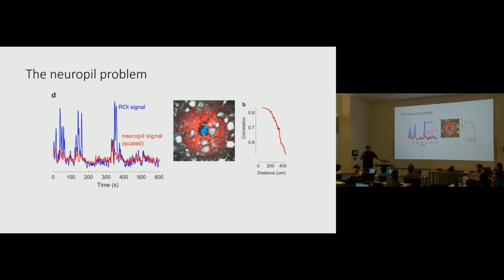And if you start analyzing that signal, which people doing wide field imaging do, you start realizing that it has all sorts of interesting functional properties, like it's responding to stimuli. In visual cortex, it's retinotopically tuned, actually much nicer than the cell bodies themselves, because it's representing this very average signal. It tends to be a lot less noisy than the single neuron signal. But of course, while it can represent anything that's shared between neurons locally, it can't represent the salt and pepper tuning of these cells. If nearby cells respond to different stimulus properties, their average isn't going to respond to that. So that's another reason to want to get rid of the signal as much as you can, because oftentimes you don't care about the average responses of all the neurons in this area. You really care about how some neurons respond differentially from other neurons.